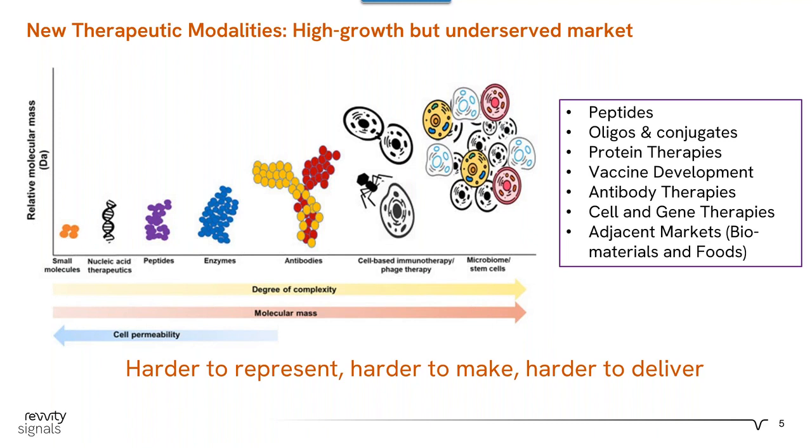So we require these tool sets to support effective communication toward increasing the speed and accuracy of developing the candidate drugs that we're here to deliver. And as a software company at Revvity, we really think about this a lot. We support many modalities and aim to improve our use cases as we evolve over time. And at the end of the day, I think what researchers are really interested in is a tool that can support experimental design and scientific understanding of their modalities in an easy to use tool while maintaining seamless communication between the teams.